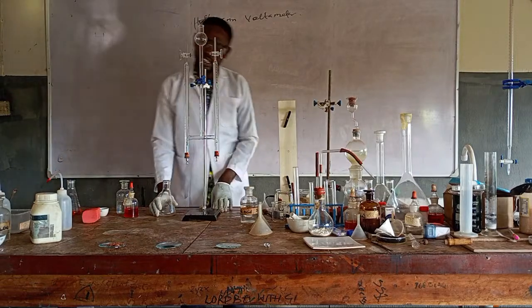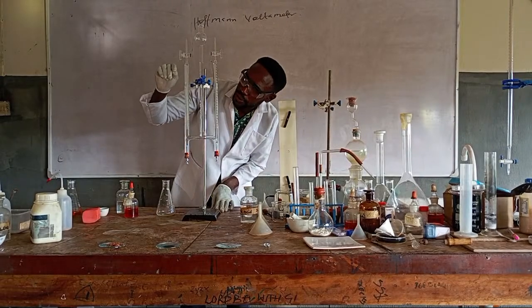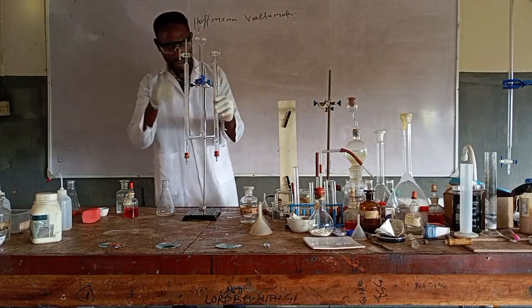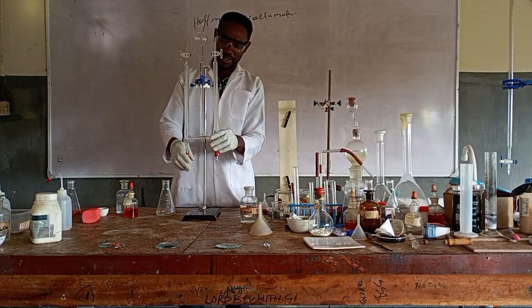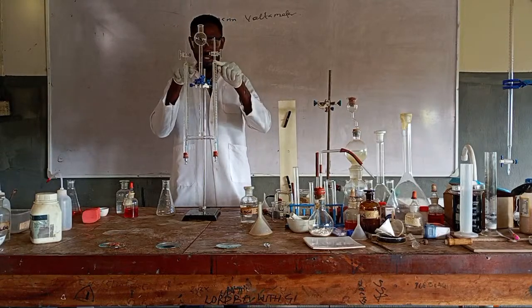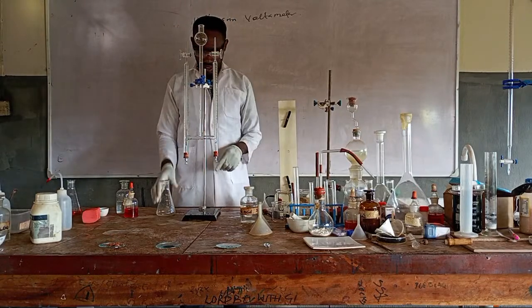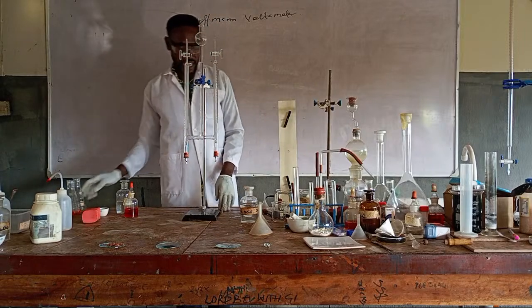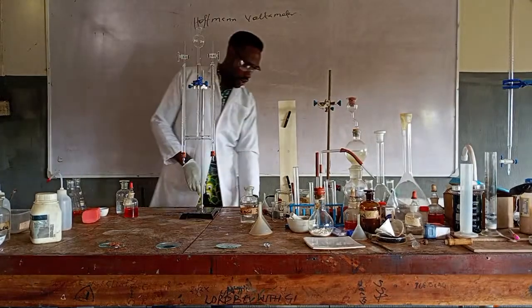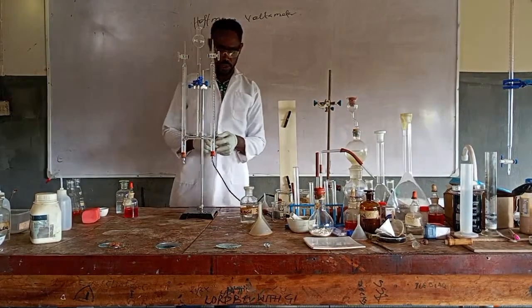Yeah, this one is above 0, but this is 0. So what do we do now? It will affect the volume at the process, but I already know this is not correct. It's not aligned well. It will not waste our time. So next, I will connect this to a source of direct what? Current. DC is what we use.